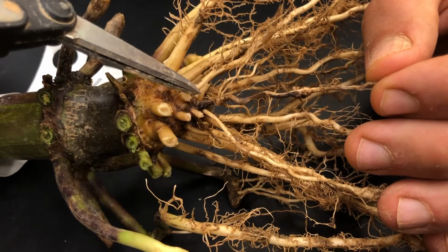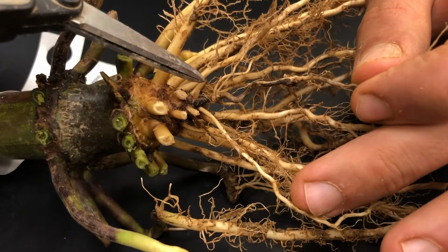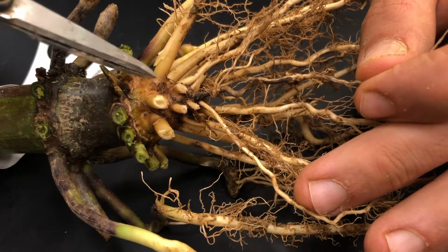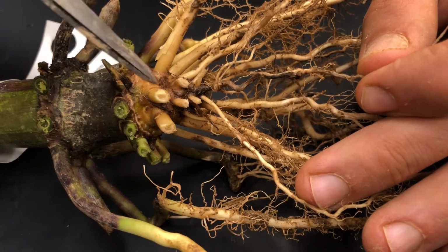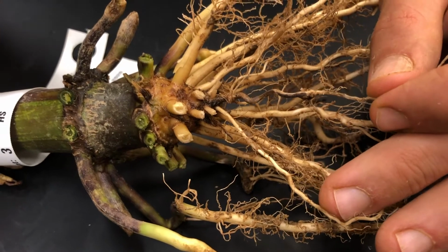Here we see the first whorl of nodal roots. These are the oldest nodal roots in the crown, and are the first nodals to emerge after germination. As the plant goes through its vegetative stage of growth, new, subsequently thicker nodal roots are emerging above the older roots in the crown. So here's the second whorl, third whorl, fourth whorl, and fifth whorl of nodal roots.